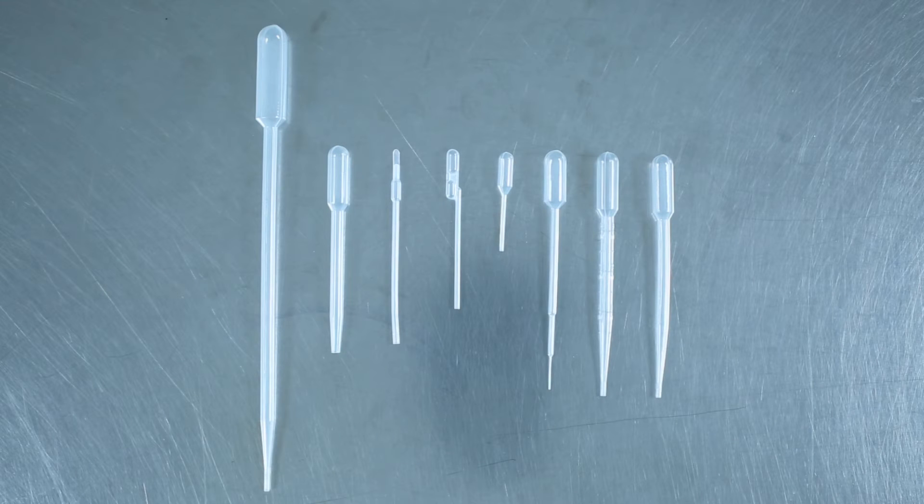The pipettes are molded in one piece and do not require assembly. We offer a wide selection of transfer pipettes ranging from general purpose to fully customized products.